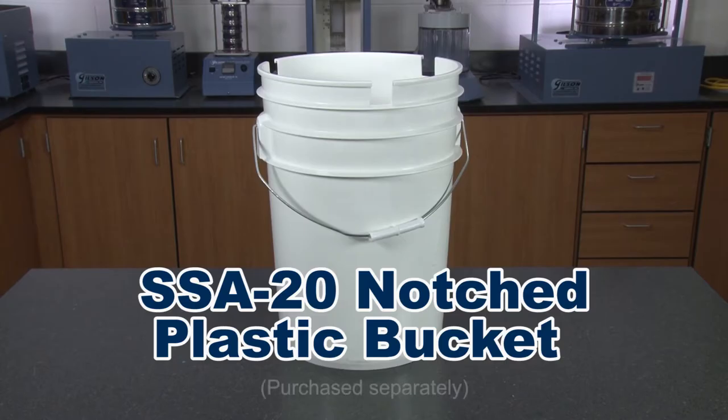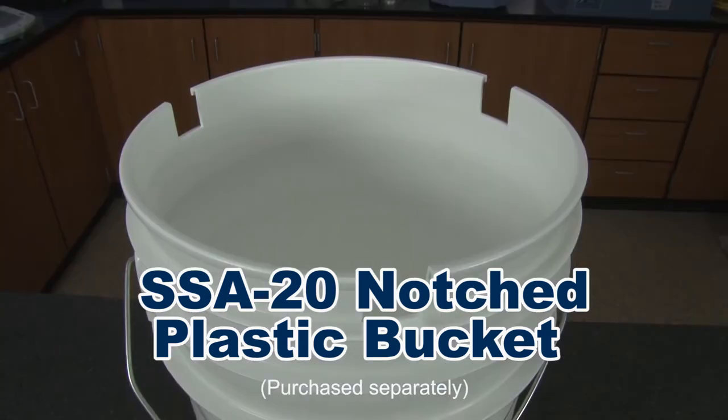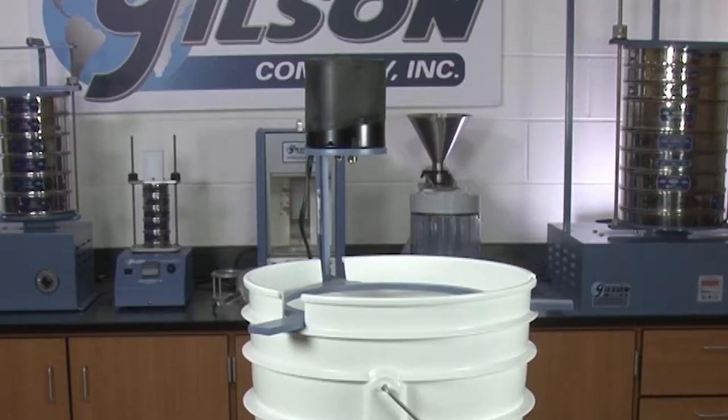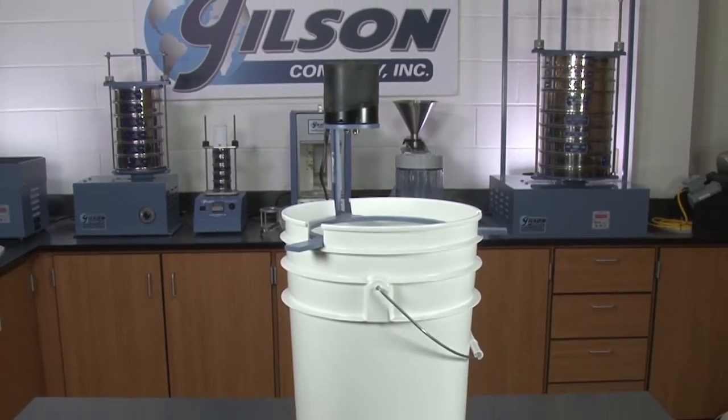The Gilson SSA20 notched plastic bucket accommodates the three legs of the SS23 shaker and serves as a holding platform to catch the discharge.